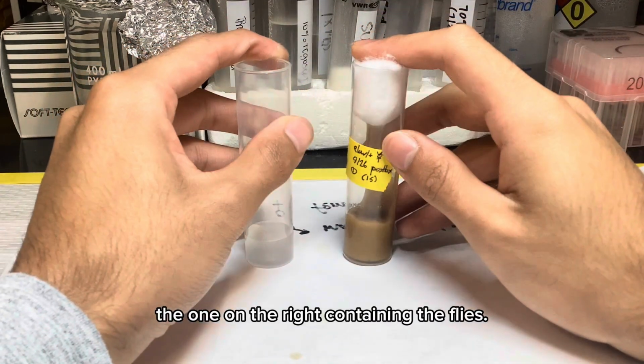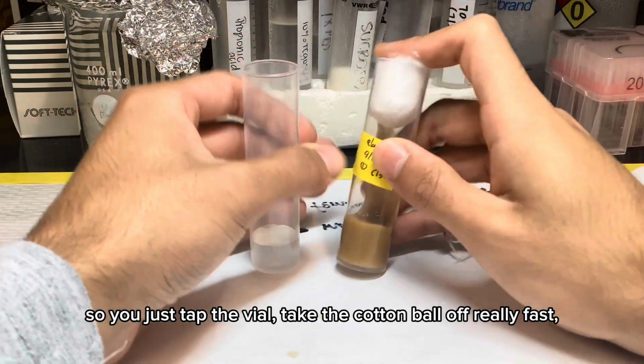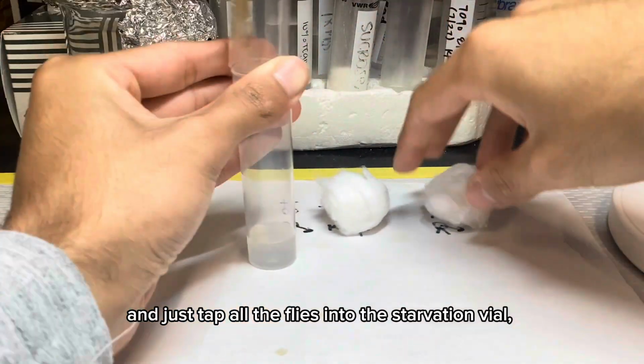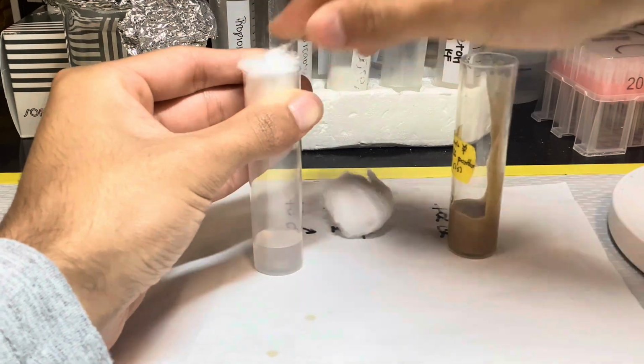Since the one on the right contains flies, you need to be careful to prevent them from flying away. So you just tap the vial, take the cotton ball off really fast, and just tap all the flies into the starvation vial. And then you just put the cotton ball back.